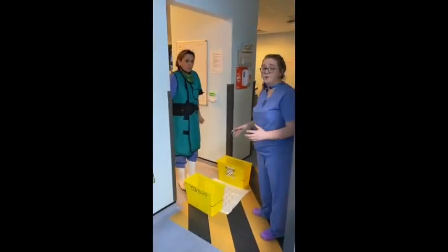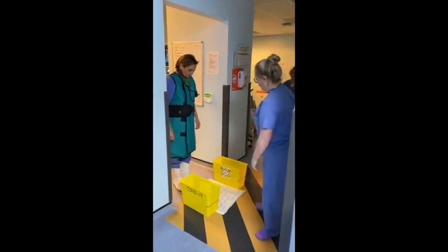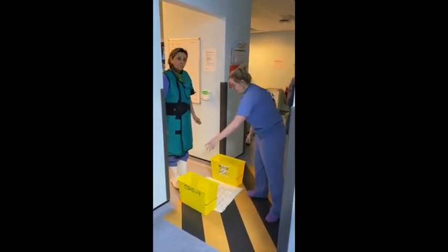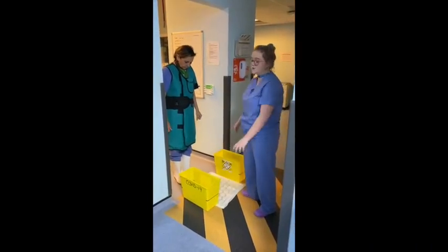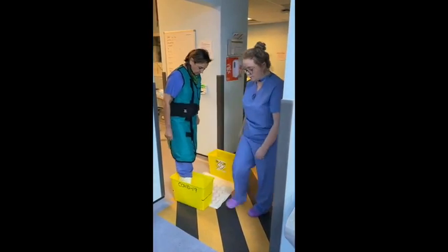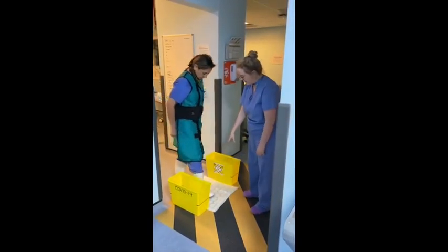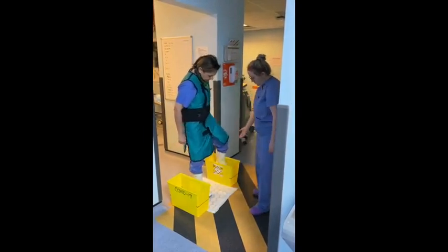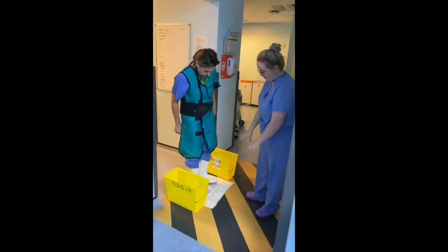Before the procedure began, one of either the nurses, radiographer, or physiologist will pop one of the chlorine tablets in each bin, and it'll be filled with water, which will have fizzled out, and this is now bleach. So you will dunk one welly in here. You kind of move it around just to splash a bit of water onto the welly. It will go down on the Inco pad, and then the second Wellington will go in here. The same thing will happen, and then you dry on the mat.